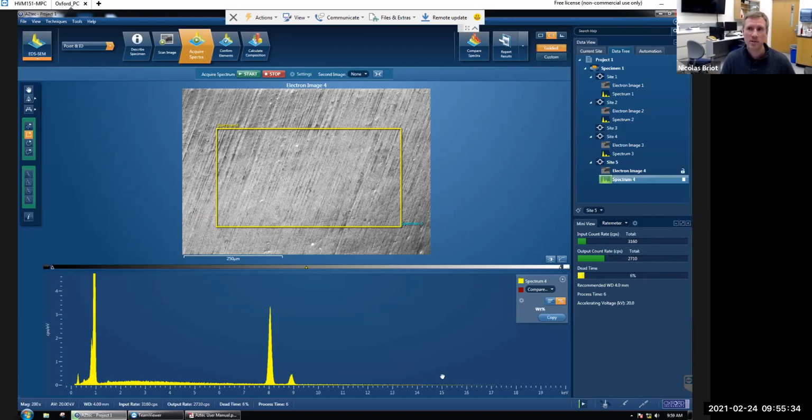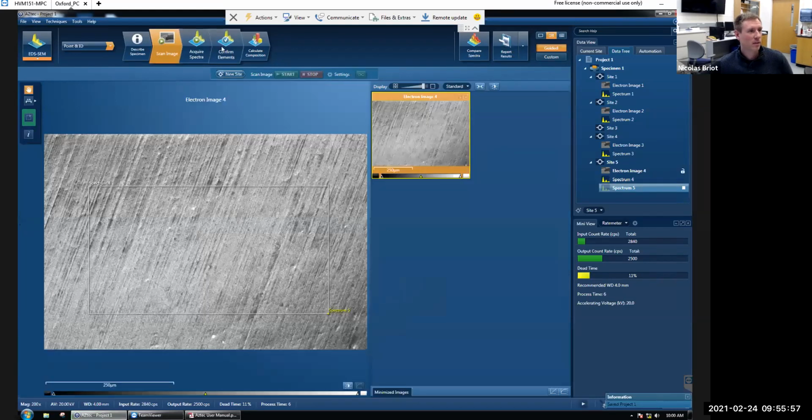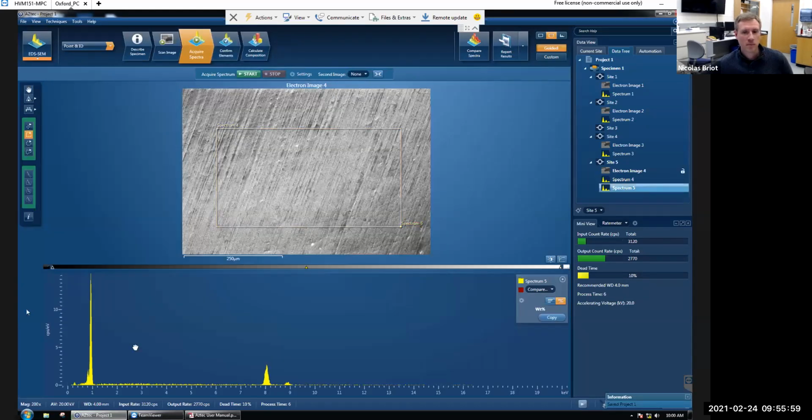For example, if the sample is not conductive, like we'll deal with in the second hour today, because you have glass, right? Glass embedded in something that's not conductive as well. Okay. So that's EDS pretty much. It gets more complicated than that, but it's a lot of just point and shoot pretty much. If you want to know what's in, oh, I think it's still running another one.